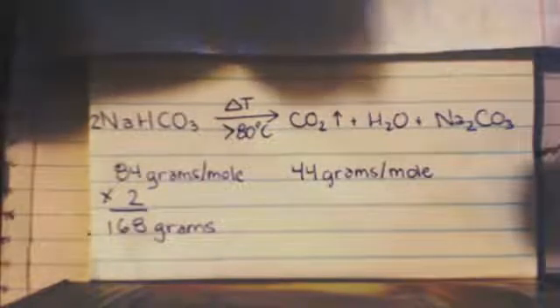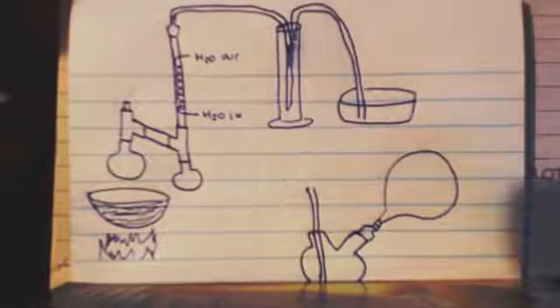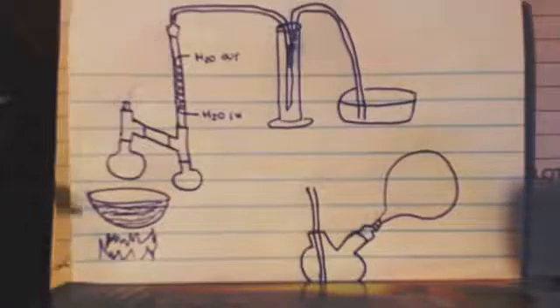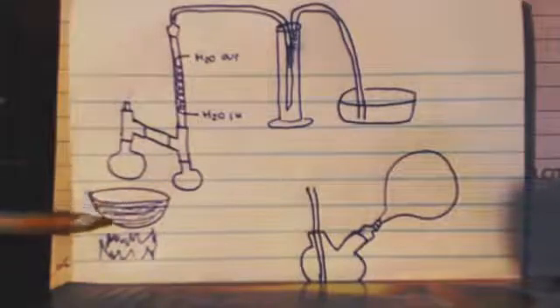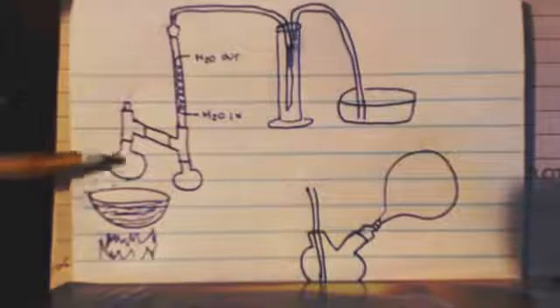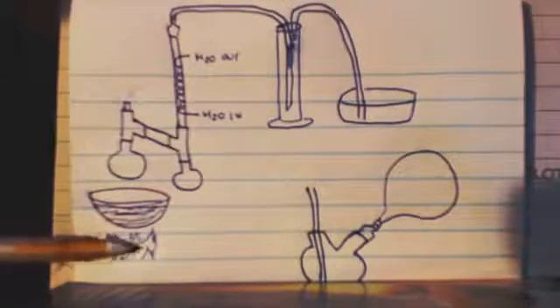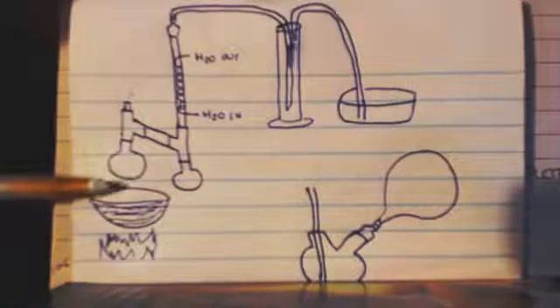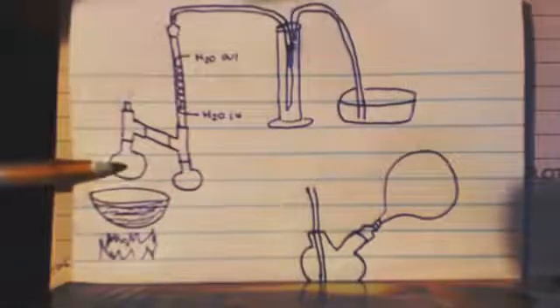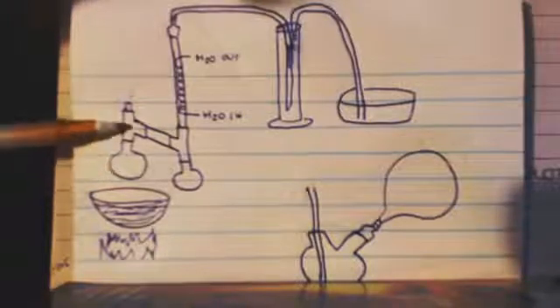This is the apparatus I'd make. You can see I got my flame, this is an oil bath, this would have my sodium bicarbonate in it. I would raise and lower this and put the heat on so I got it fixed at a nice slow rate of bubbling. You will make your carbon dioxide and you will make your water.